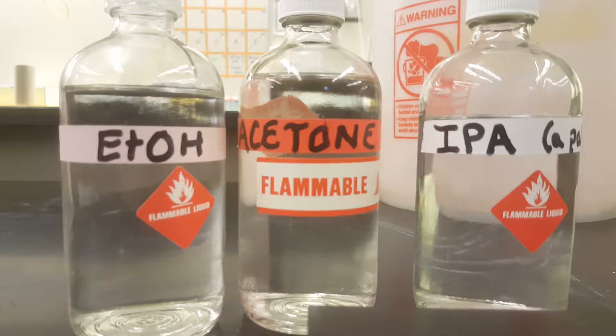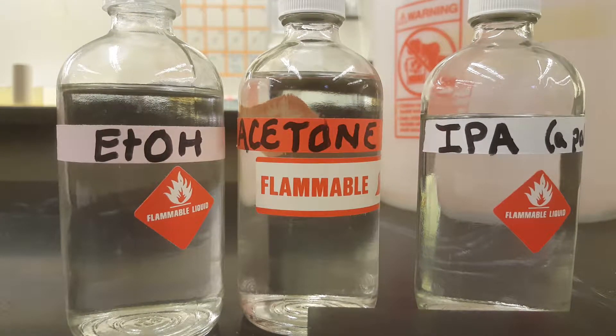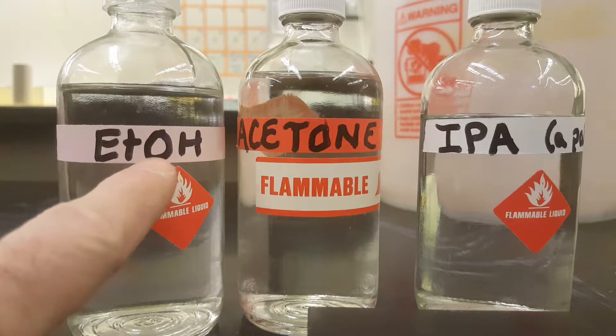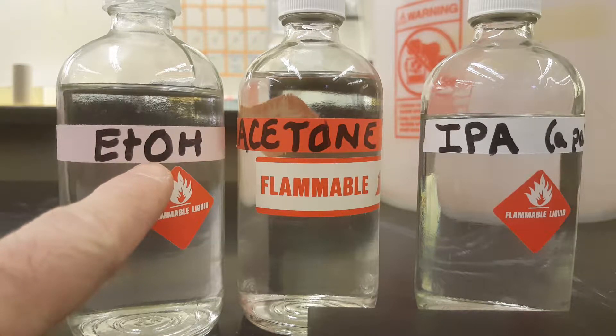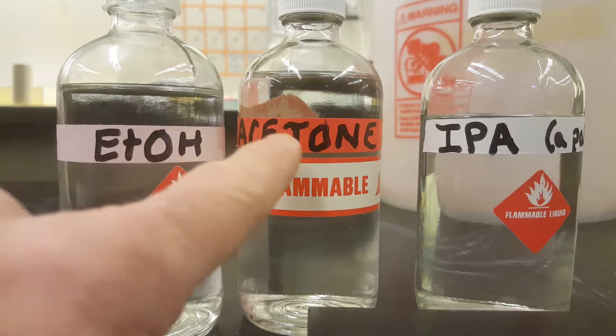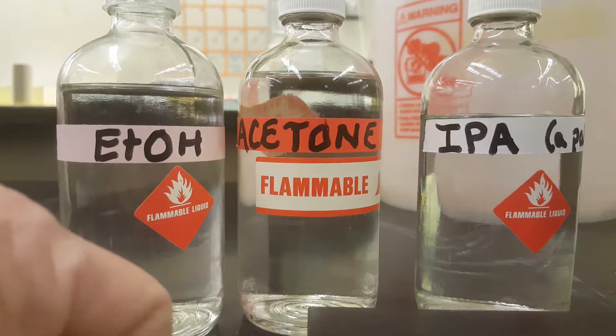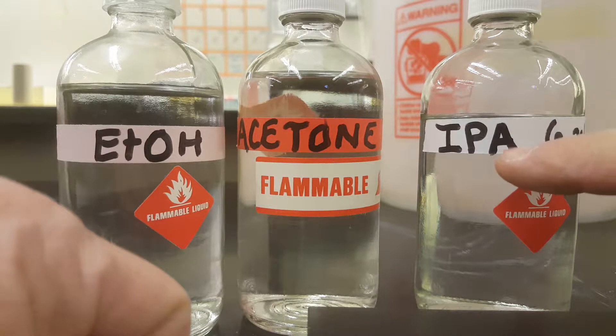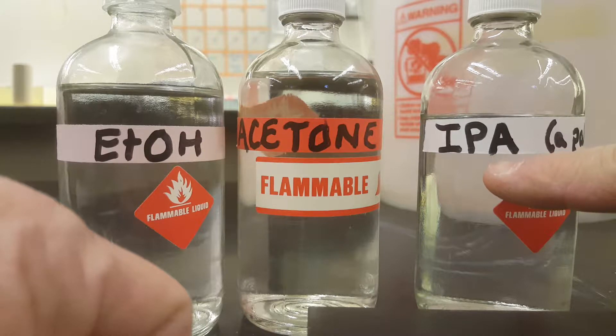These are your three volatile liquids today. And I just want you to make a note that ETOH is the shorthand for ethanol and of course acetone. And isopropyl alcohol is your IPA.